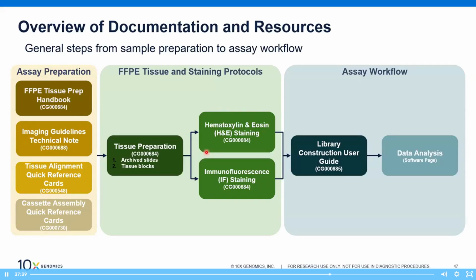But if you go into the support website, you will find a lot of information, for example, on how to prepare your tissue if you are new to this, or if you need guidance there. We have imaging guidelines in a new tech note that is specific for Visium HD. So if you are uncertain how you need your imaging set up, this will give you a lot of information and a lot of help.